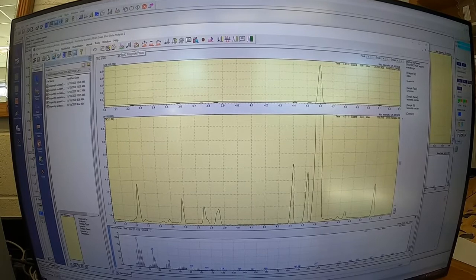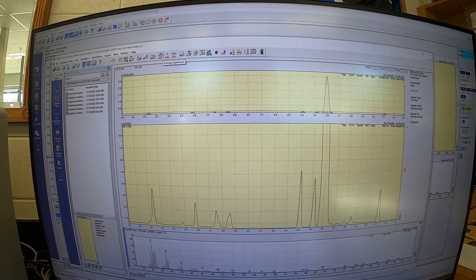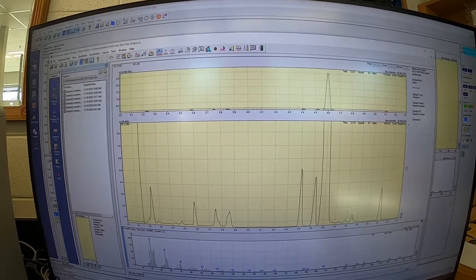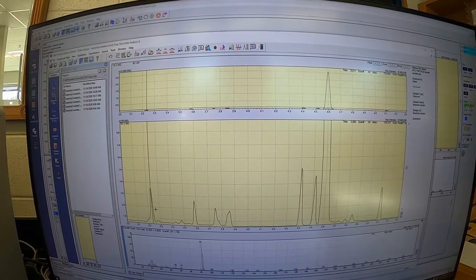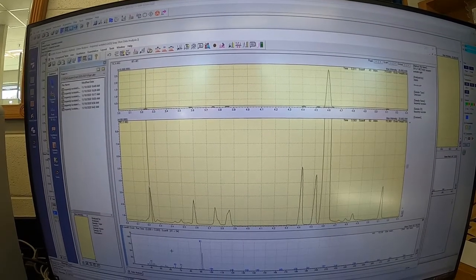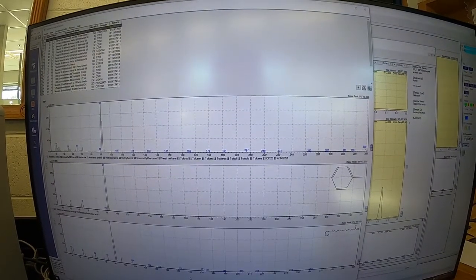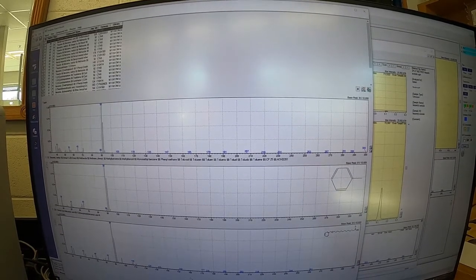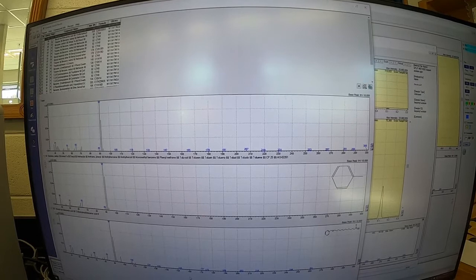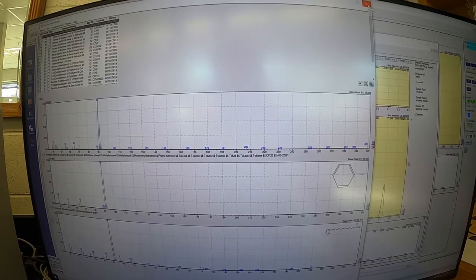And what we can also do, what's really cool, if you recall from the theory of mass spectroscopy, we want to look at the positive ion fragments. So I'm going to analyze those positive ion fragments and look at what this peak around 3.2 is. And I can do a similarity search. The similarity search says that it's methylbenzene, 84% chance, or toluene. And to me, what that probably refers to is a little bit of impurity in my hexane solvent.